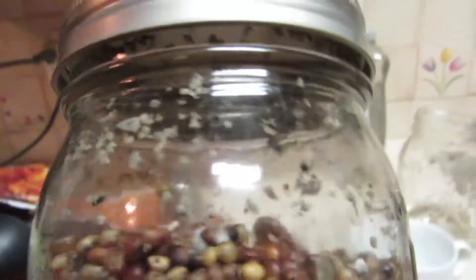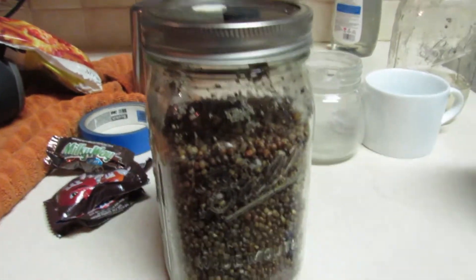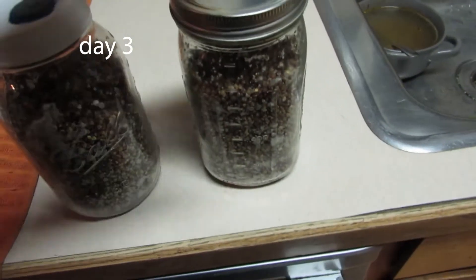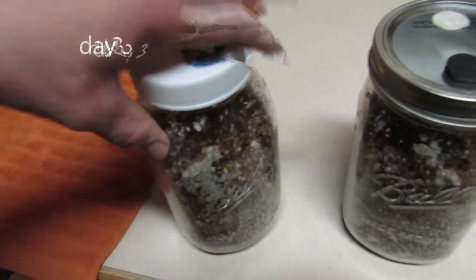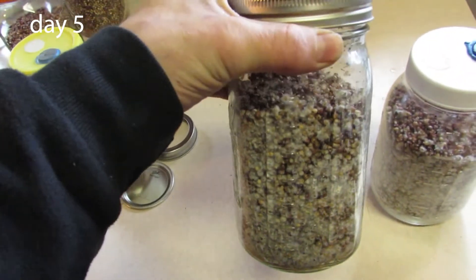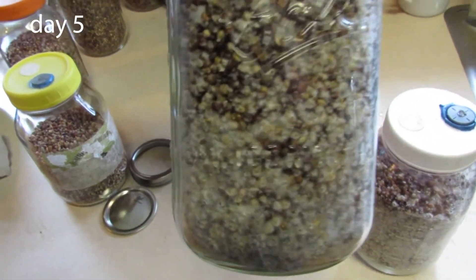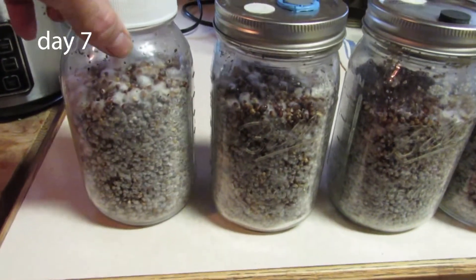As you can see, we already have little spots of mycelial growth. By day three, there was even much more growth. Here's what a couple of those jars look like on day five. And look at that — one week later and they're almost completely closed in.